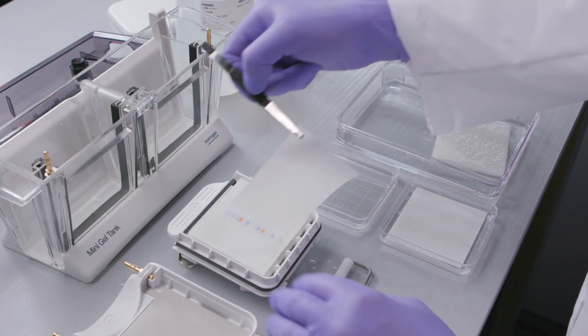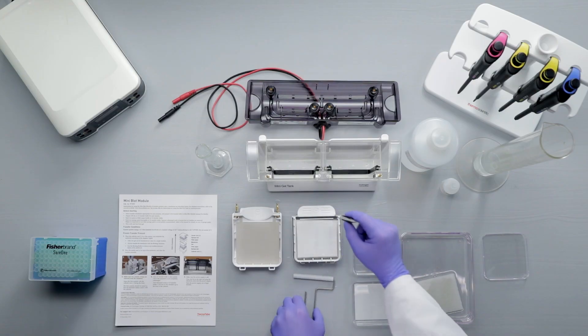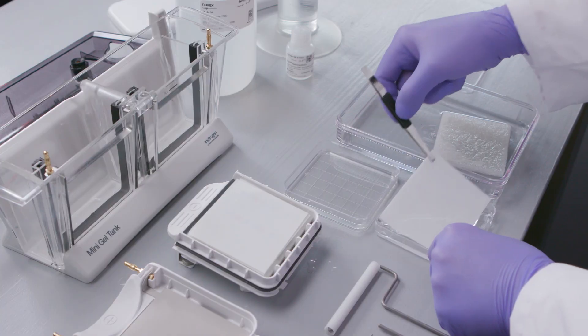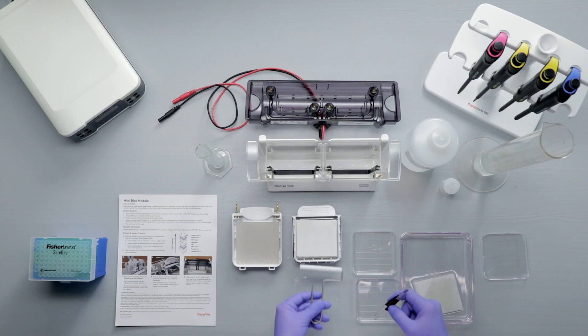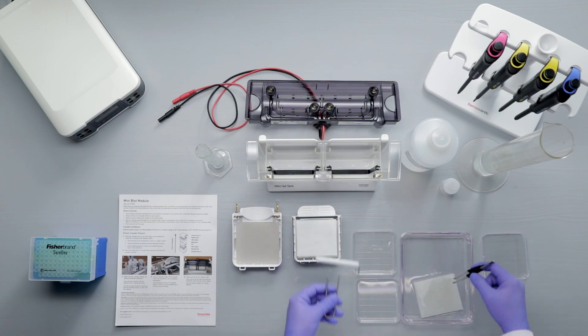Using tweezers, place the membrane on top of the gel and roll once more. Complete the stack by layering another pre-wetted filter paper on top of the membrane, removing bubbles, and placing pre-wetted sponge pads on top of the filter paper.